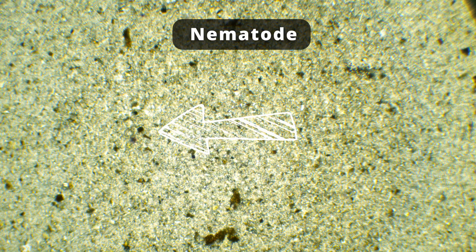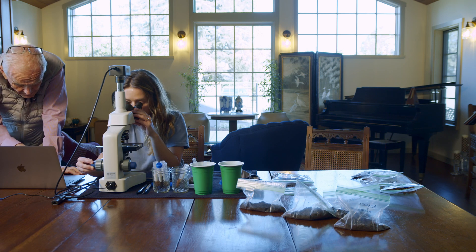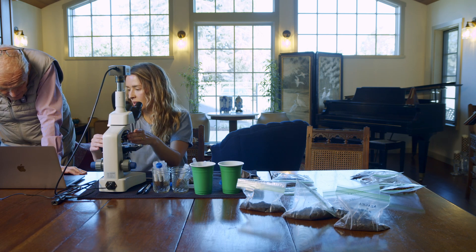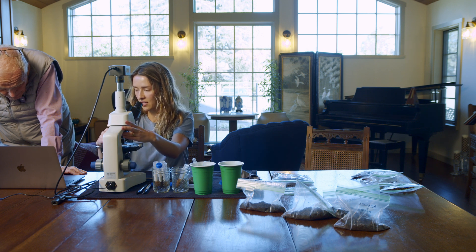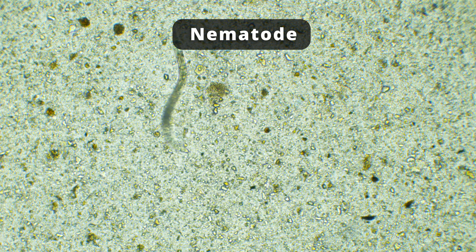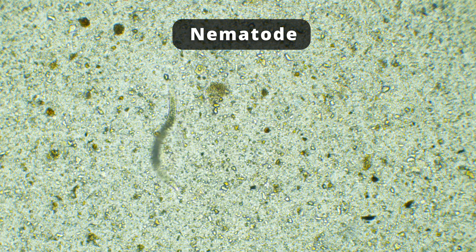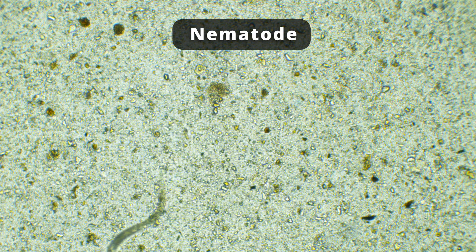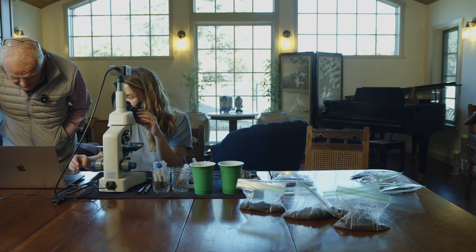I just found one — let's zoom in on it. I'm going to go to 100x. I've got to focus on him. You see him? Yeah, he's moving around in the corner there. He's quite agile. It looks like he's feeding right now. I'm going to zoom in even closer so we can see the mouth parts. He's just squirming around. In simple terms it looks like an earthworm, and you can kind of see the digestive system — just a very unusually active one.